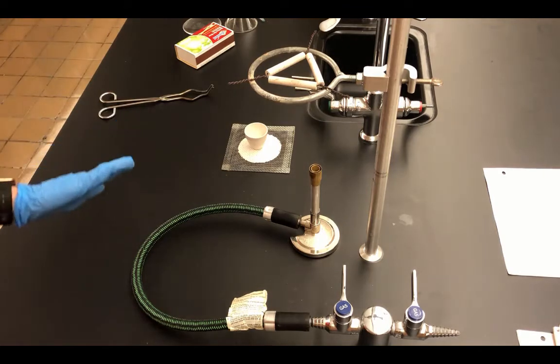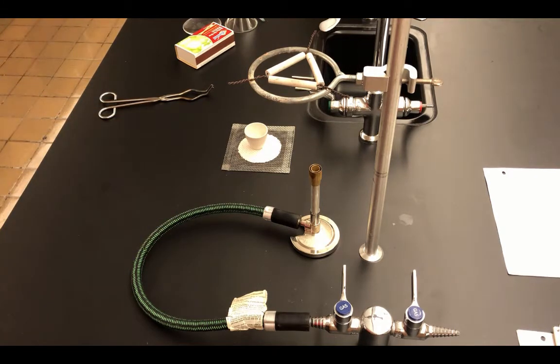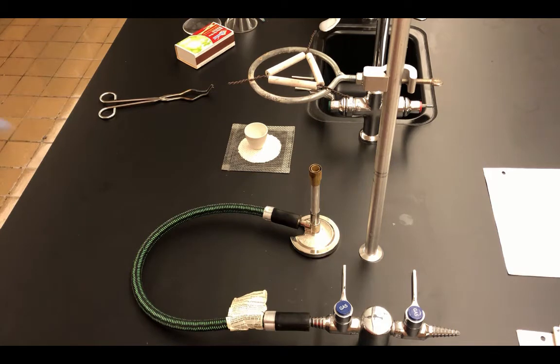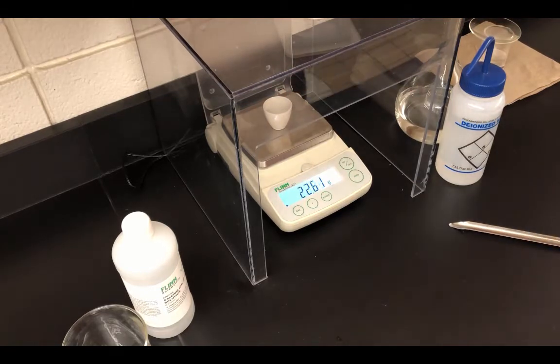The reason that we let this cool completely is because if we try to find the mass of something that is warm, the mass will be slightly less than what we would expect because it's creating convection currents. It's warming the air around it, and this is going to cause the mass to be a little bit lower. So we want to make sure that it's cooled completely to ensure that the mass is accurate. Now that the crucible is cool to the touch, I can pick it up and find the mass after the first heating.